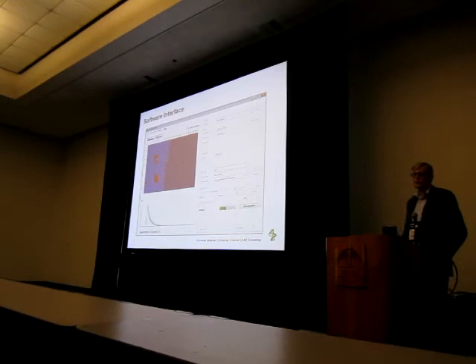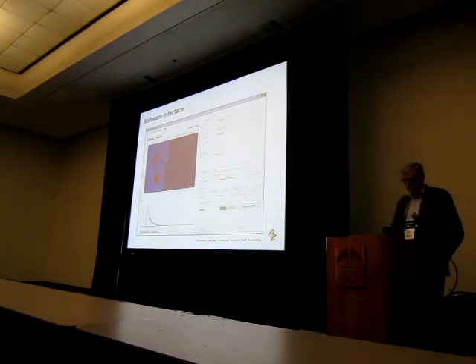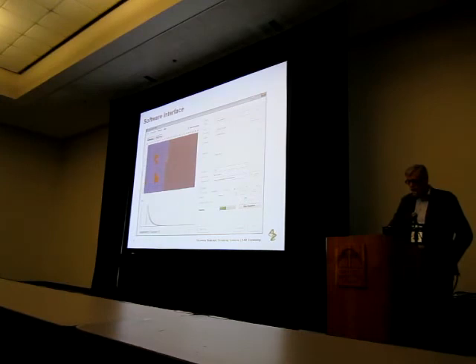So this is what the software looks like. You can see the light blue patch is the part of the plate that's already been read. In this case, it's reading boustrophedonically, up and down, as opposed to in rows. The wells highlighted in red are the wells where the system has done the initial analysis and identified there's a problem. So quite clearly you can see in this case that there are some wells on the plate where there are some issues.